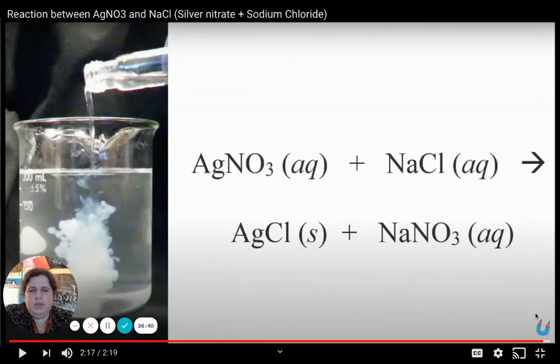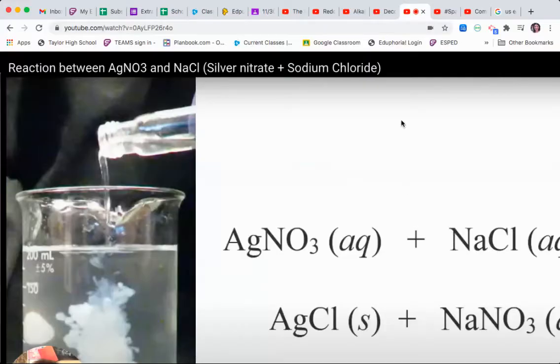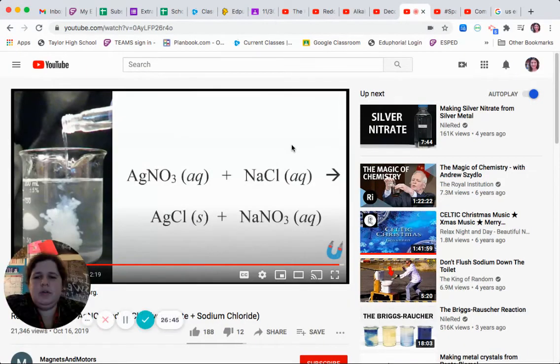Okay, all right, home stretch here. So that was two elements, two metals replacing each other to form two new compounds, one of which was a solid. So I'll let you think. What type of reaction has two metals switching places in order to form a solid precipitate of some sort? So think back on what we've learned over the past week.